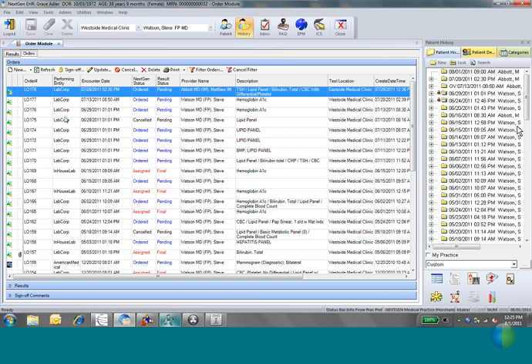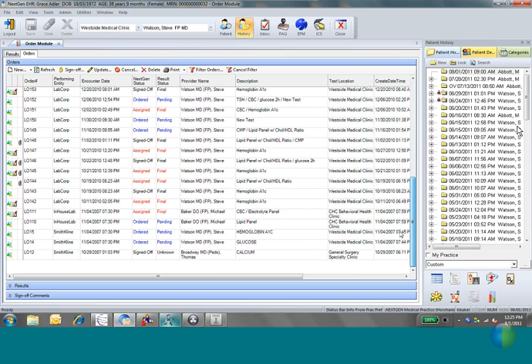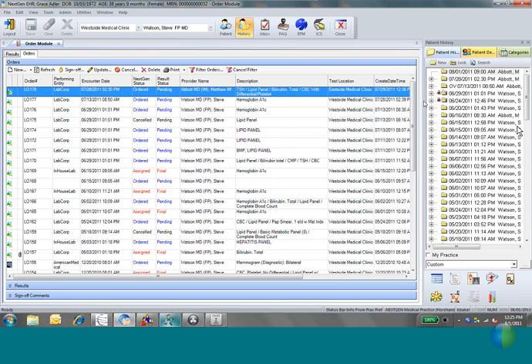And remember, again, the first screen that you see is the list of all existing orders for this one patient. So obviously I use this patient a lot to create orders, and you can see if you scroll down they have lots and lots of different tests that have been done. But any given patient could have this long of a test or order list in the future.